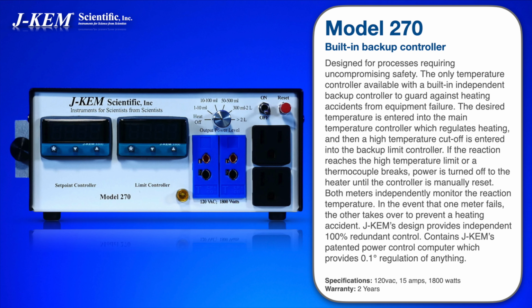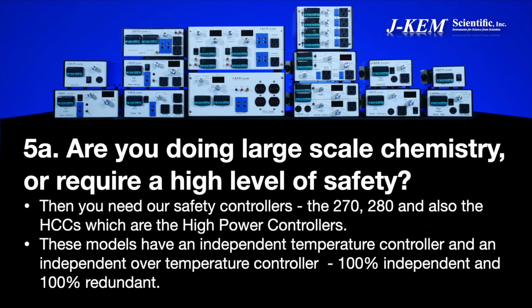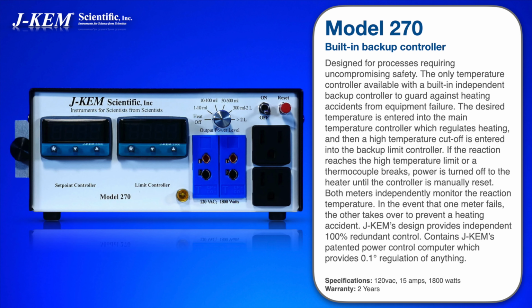For example, there's our Model 270, design of which has 2 independent controllers in the same cabinet. There is the temperature control meter in the cabinet, and there's also an independent backup controller. The important thing to understand is that the set point controller and the backup controller share absolutely nothing in common. They're 100% independent of one another. They're 100% redundant.